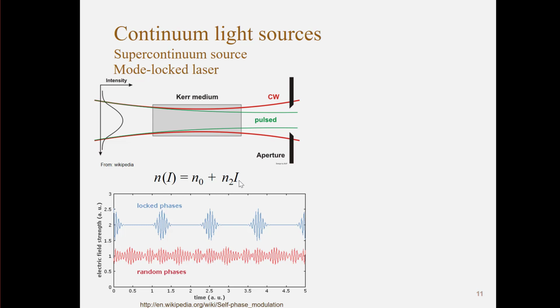And in many of the lasers used, it's actually the crystal where we get lasing that also has a Kerr effect, so you can use the same crystal as your Kerr medium. The only thing you have to do is set it up correctly and introduce an aperture. Sometimes you have to introduce a little bit of extra noise by knocking one of the mirrors slightly.